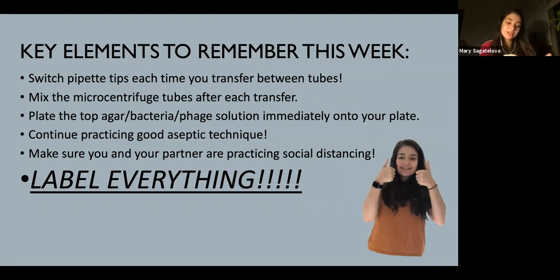Okay, we're paying attention to what we're pouring into what tube, to what plate, so that the label matches every time. Okay.